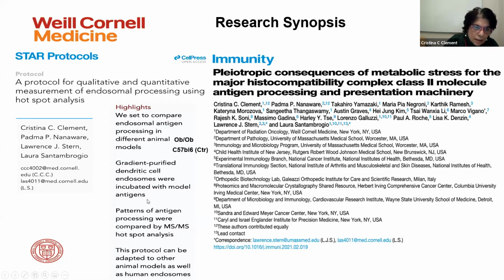On the other side of the matter, we also proved the late endosomal compartment accumulates a lot of post-translational modifications, and somehow they will have a different processing capability of the antigens, and the peptidomes derived from these antigens could be different because of the different redox-accumulated post-translational modifications.